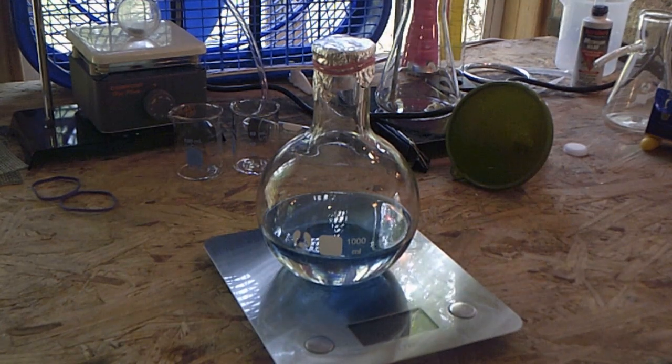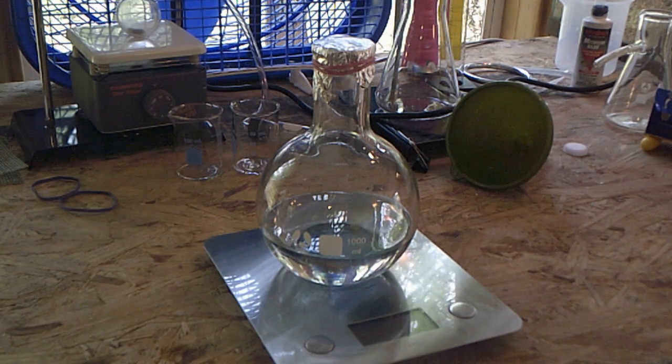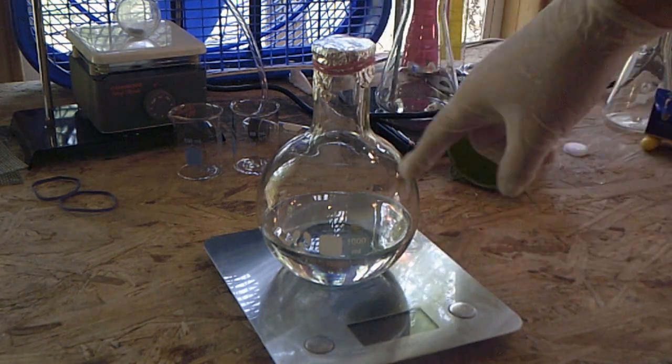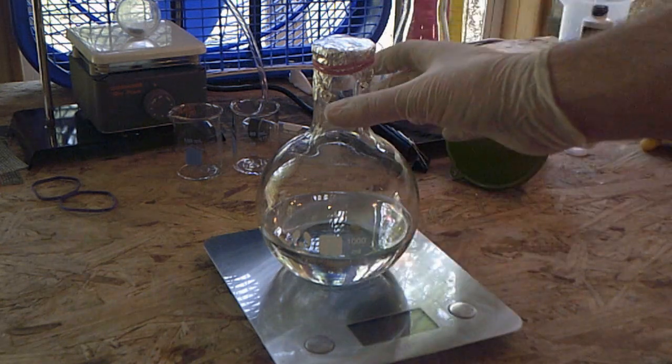And you guys can see the top layer is still a little bit more blue, the bottom layer is turning colorless, and we're losing that color now as the dextrose is absorbing the free oxygen that changed the reaction into blue. But then, and this is my favorite part about this reaction, right? So we started blue, now we're at colorless. I'm going to cause another blue color change by shaking it up and putting oxygen back into the reaction. So we'll do that redox reaction.